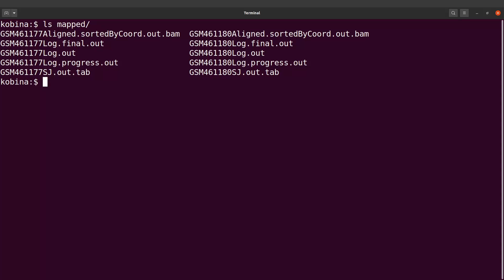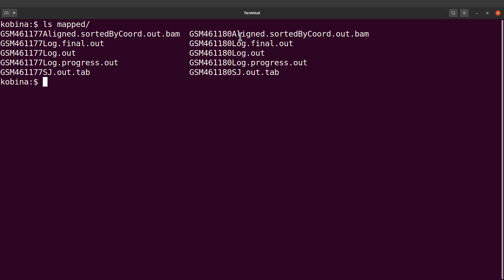We will call featureCounts and then we will supply the BAM files. Before we do that, let's first create a directory. We will call it 'counts'. This directory is where we will store the outputs. So now we have a directory created.